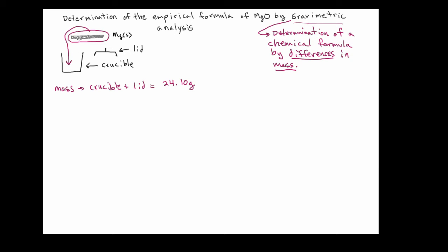Now, technically speaking, this strip of magnesium is probably between 10 to 20 centimeters in length. And what you may want to do is roll this up on like a pencil or a pen, but don't make the roll very tight. All you want to do is get this thing rolled up so it'll fit into the crucible, but you don't want the roll tight because the metal needs to be exposed to the air. And if you compress this thing up into a really tight mass of rolled up metal and put it in here, then when we carry out the chemical reaction between magnesium and oxide, the reaction's not going to go very well.